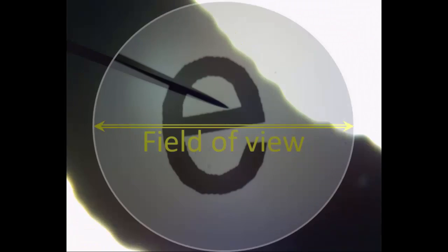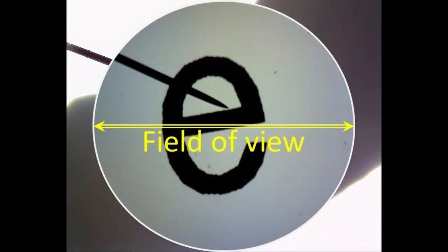Finally, adjust your letter E so that it is in the center of your field of view using the stage adjustment knobs. Notice how much smaller the field of view is here compared to what we saw with the scanning objective.